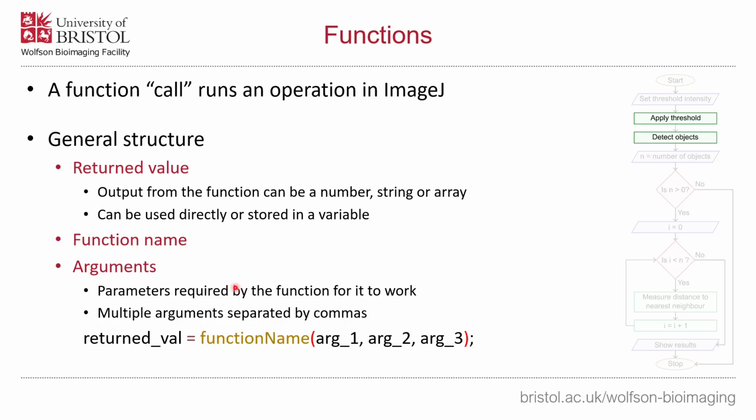And then the final bit here, these are your arguments. So in the case of the print statement, we took a single argument. That would either be a string, so a piece of text, in the example of things like the hello world, or it could be a number, as we did print 42 right back in the beginning of macro 1.